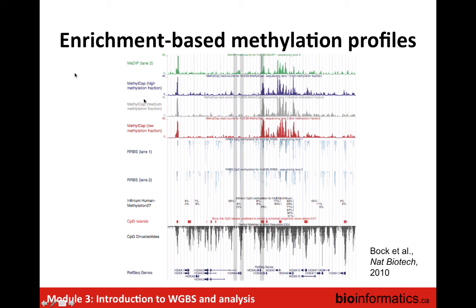While the MeDIP and the METH-CAP, again, this is now an enrichment base, exactly like what you saw yesterday, where you have profiles that are enriched basically for methylation. It's different in the sense that it's not base pair resolution, but you definitely get a sense of which regions from this data have high or low methylation, and so you can do analysis very similar to what you did yesterday, where we're looking at DNA methylation.